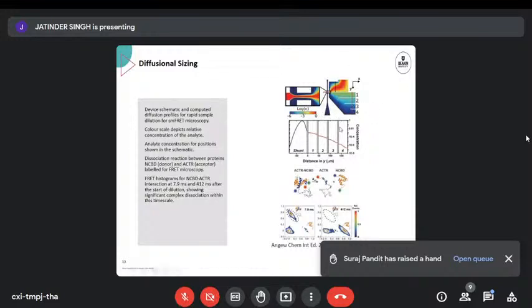How is the detector placed to get all this? Normally, I would suspect that this is off-chip spectroscopy. So they literally have got little reservoirs sitting at the end here. And then the liquids are taken out of the chip and injected into a stagnant phase to do the spectroscopy. It's not online. I suspect if it would have been online, I would have written it on here. This is not written with online detection.